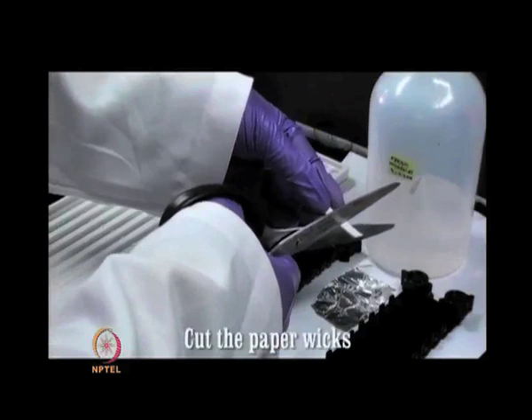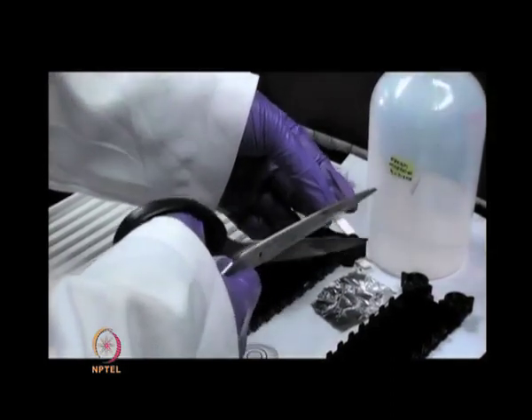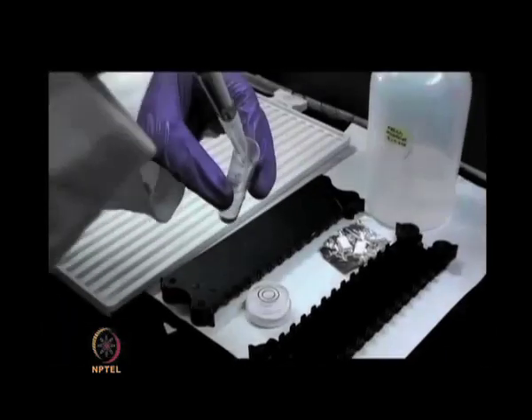Cut the paper wicks required for focusing to a suitable length and wet them with a small amount of water before use.